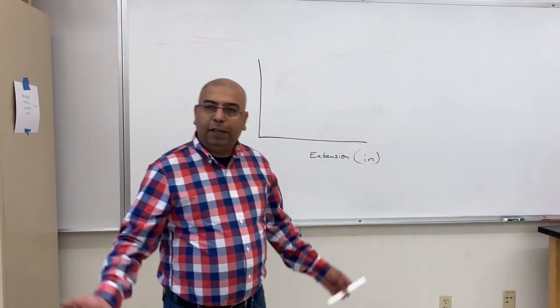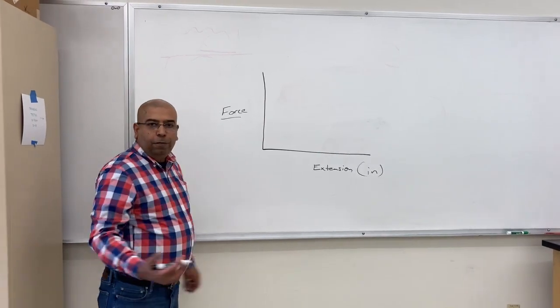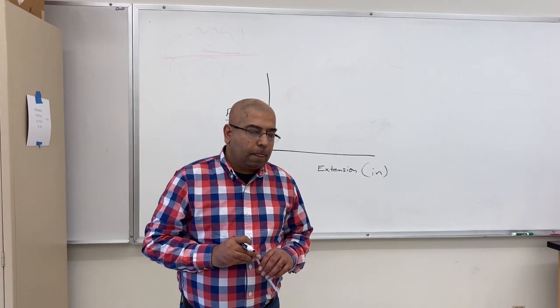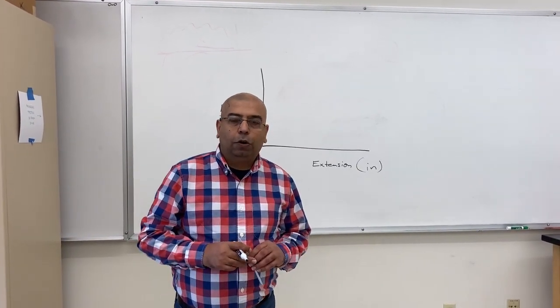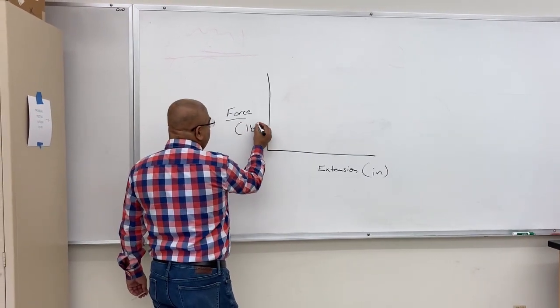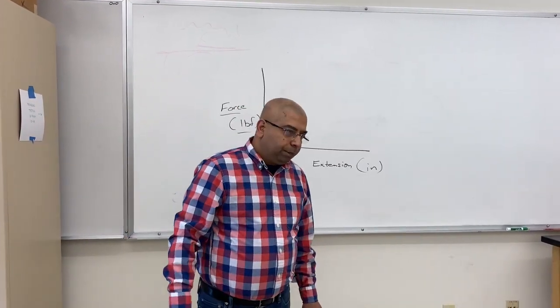So let's say it's inches. And units of force, you can have newtons, or you have pounds force. So let's say I have pounds force, right?